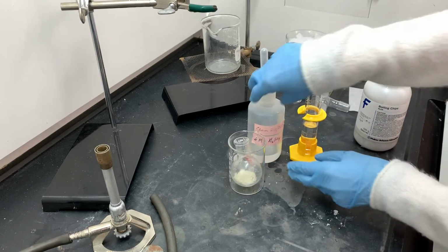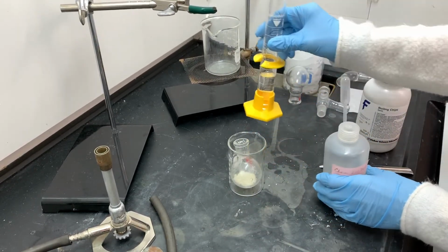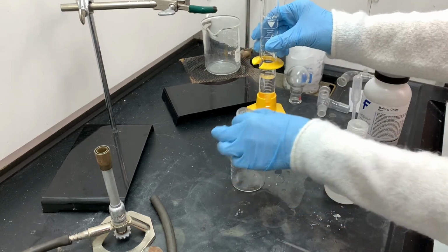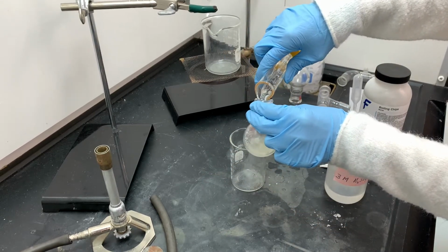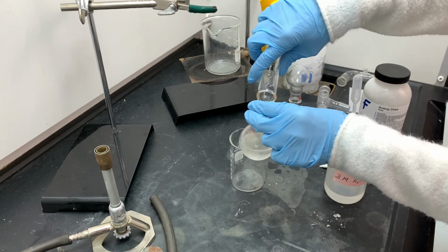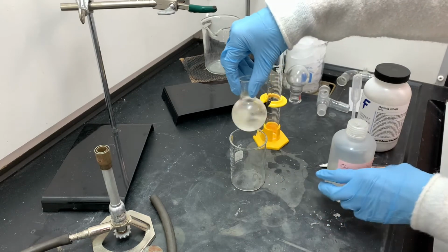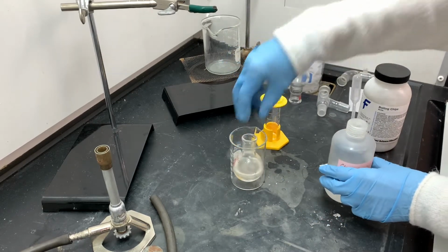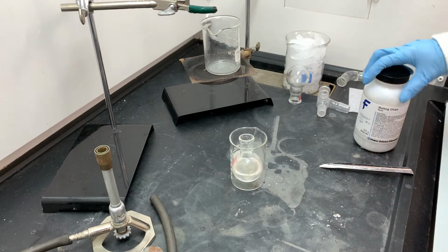The other chemical that I'm going to be adding is 3 molar sulfuric acid. I've got 20 milliliters already measured out, and I'm going to transfer that into the round bottom flask. And as I do this, I'm going to be pouring it around the opening of the flask to help rinse down any of the pinacol that kind of got stuck in the opening as I was trying to transfer it into the round bottom flask.